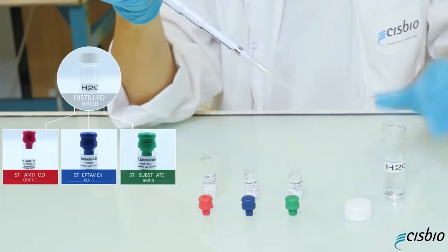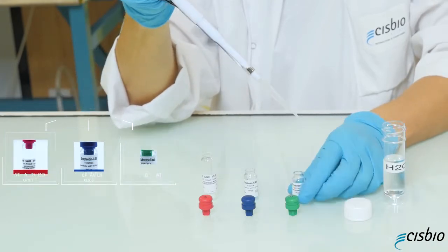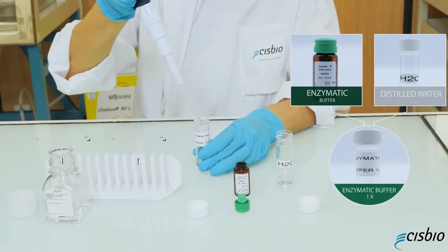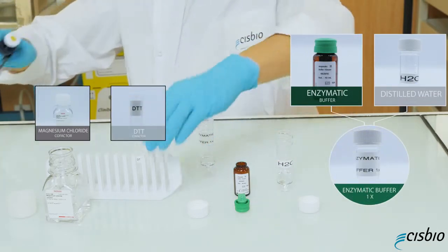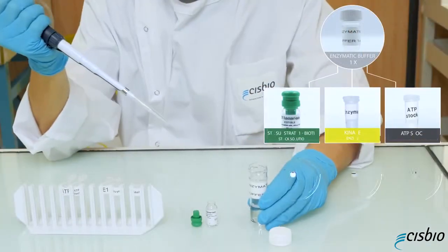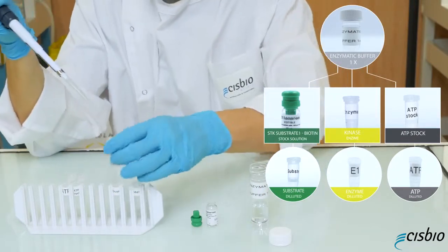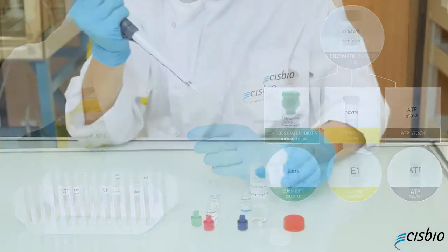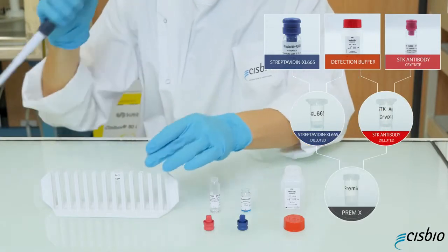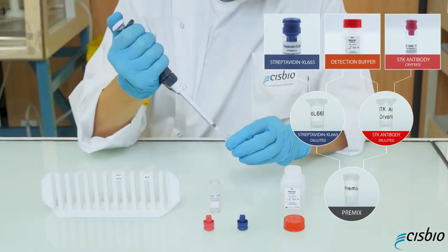Start by preparing the substrate and detection reagent stock solutions by reconstituting the lyophilisates with distilled water. Prepare 1x enzymatic buffer by diluting the buffer fivefold with distilled water and supplement it with the appropriate cofactors. Then prepare all the working solutions: STK substrate, kinase, and ATP are diluted in the supplemented enzymatic buffer, while the two detection reagents SAXL665 and STK antibody cryptate are diluted with the detection buffer, which contains EDTA used to stop the enzymatic reaction.